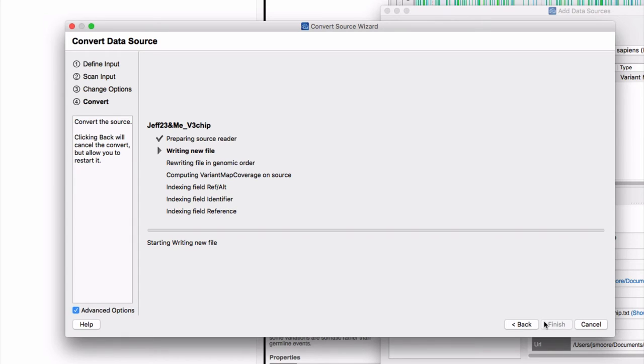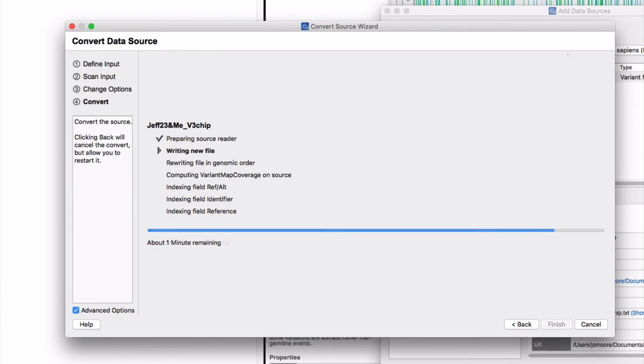This next step takes some time, so you'll need to be patient. On my MacBook Air, a vintage 2015 machine, it took about a half hour.